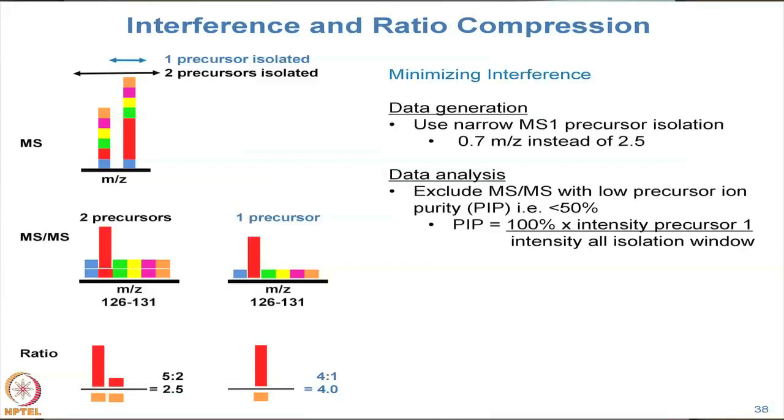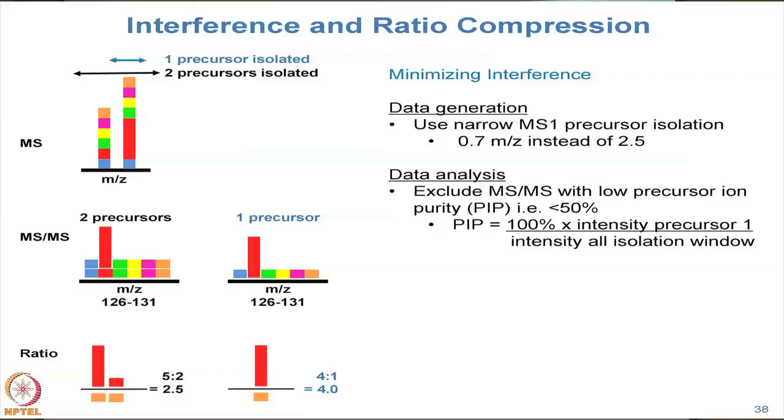All right, there's another sort of complication in working with TMT quantitation, and that comes down to interference, which goes back to if you fragment more than one thing at a time, okay? And so what I've tried to do is draw a cartoon here to illustrate how this works. If you had two peptides of very similar precursor mass that were present at the same time, and let's say one of them is uninteresting. There's no one of the six samples that has either up or down regulated levels of protein. But in the sample that's right next to it, it has up regulated levels of the red. So there's way more red in this one than there is in the other one.